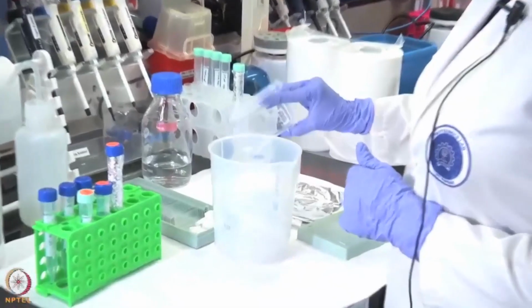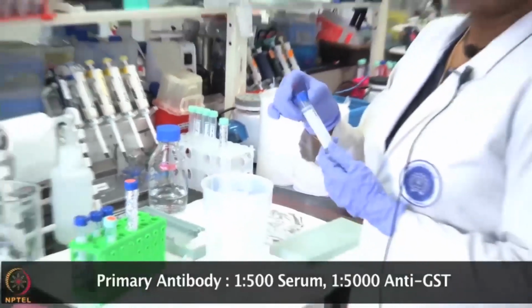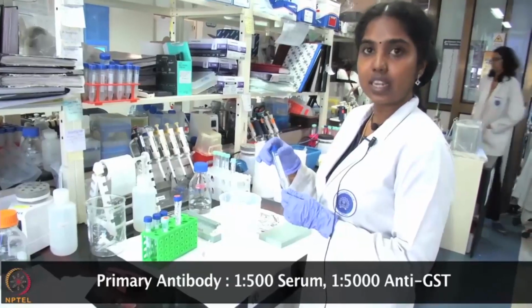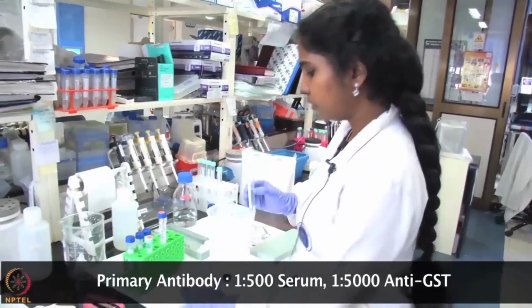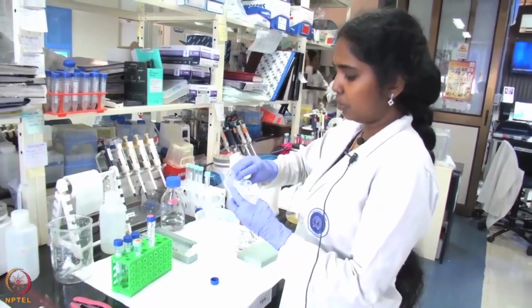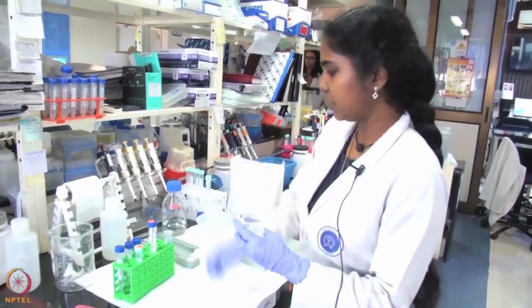Then you have to incubate with primary antibody, which is a mixture of 1 in 500 dilution of serum and 1 in 5000 dilution of anti-GST. So now you are adding a 10 ml volume of 1x TBST containing 1 in 500 dilution of your serum and anti-GST antibody.